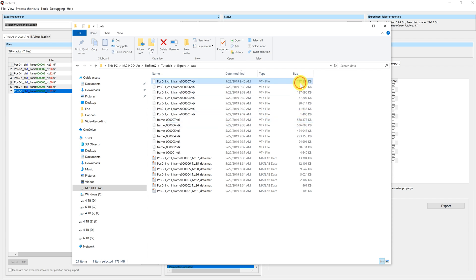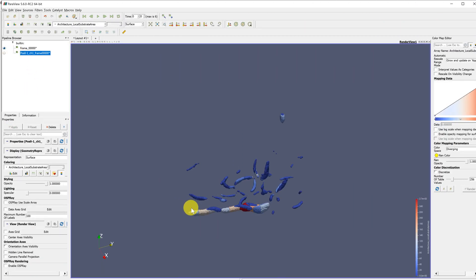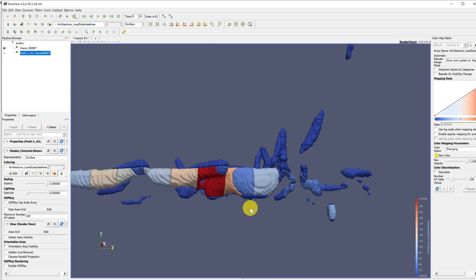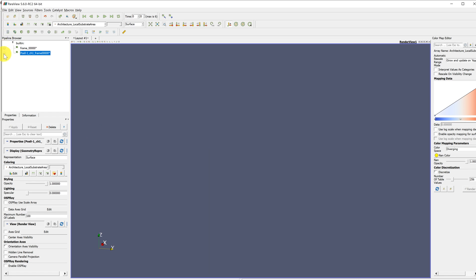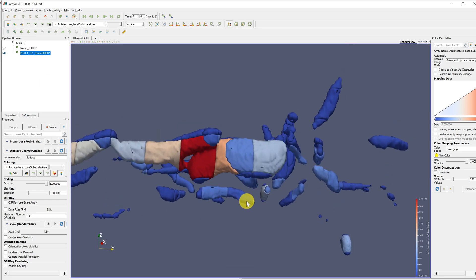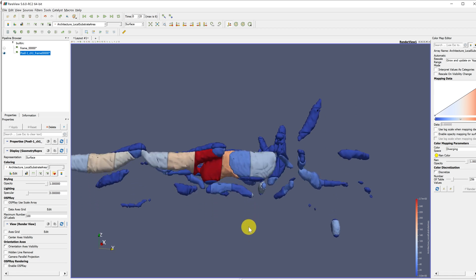The first difference you can see is that the file size is reduced by a factor as well. If we now open those two time series in Paraview, we can see that if we don't reduce the polygon number, different layers appear in our 3D visualizations. This is due to the voxel-based segmentation approach in Biofilm Q. If we reduce the number of polygons, this layering effect is also reduced and the cells appear a little bit smoother.